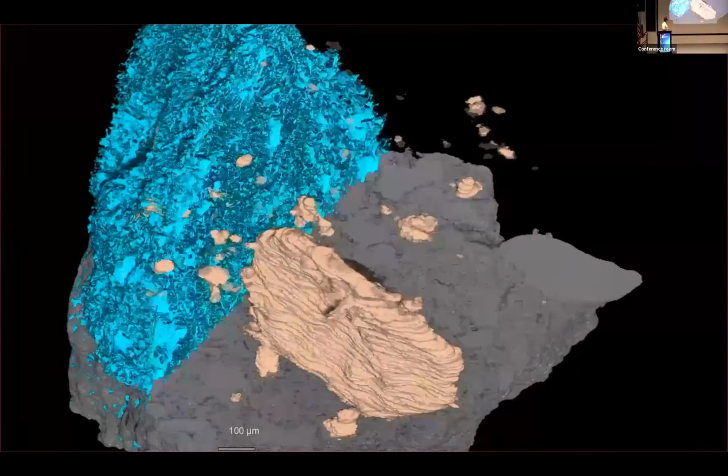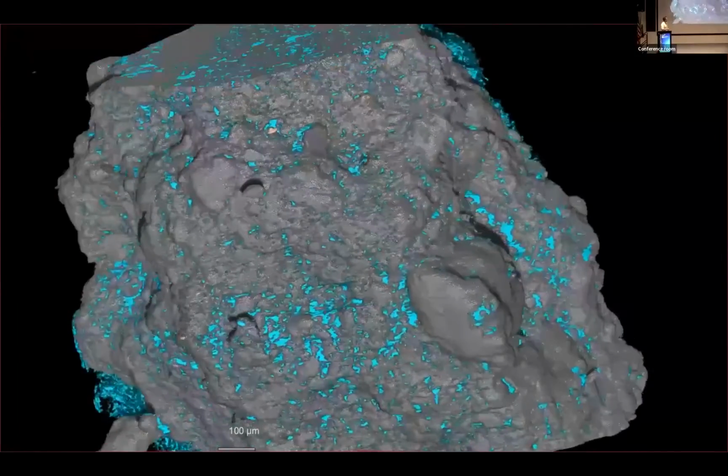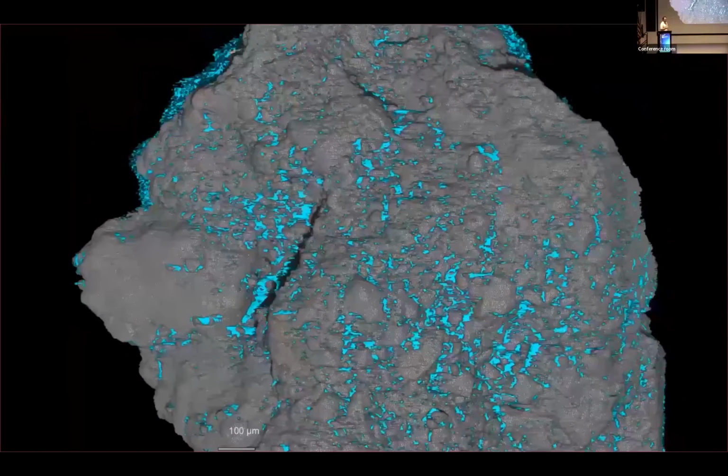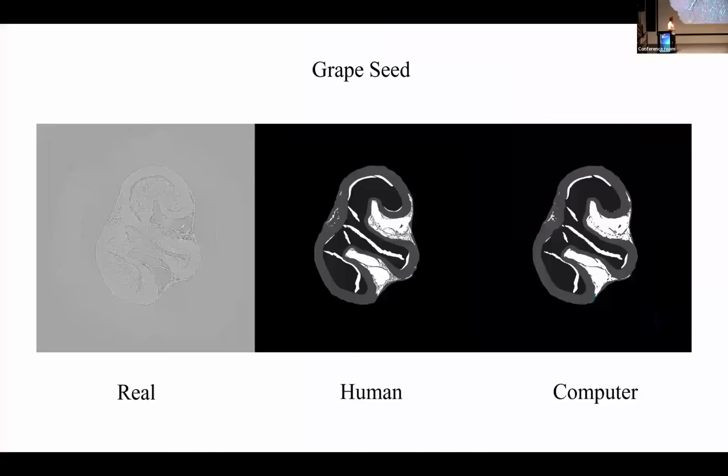Now we can really understand the distribution of particulate organic matter inside of soil aggregates, which is important for understanding how organic matter breaks down in aggregates, and what the CO2 fluxes out of the aggregates would be. We can start modeling these things that historically have been really painful to model. We can also apply this to other image data sets and ask more robust questions.